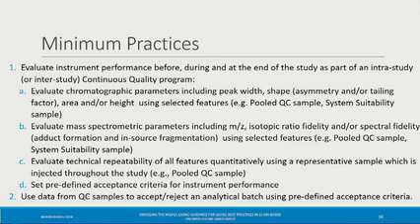So what we don't want to do with mQACC is be prescriptive, and we had this discussion yesterday in the workshop for lipid met as well. Your acceptance criteria for pooled QC will really depend on the type of application and the kind of differences you are looking at. So if you are looking for very small differences in metabolite levels, if the changes are very small, then you want a very stringent RSD to only look at very well-behaved metabolites, right? If you're looking at very wide changes, like changes that are tenfold, then you can use a wider acceptance, 20, 30%.